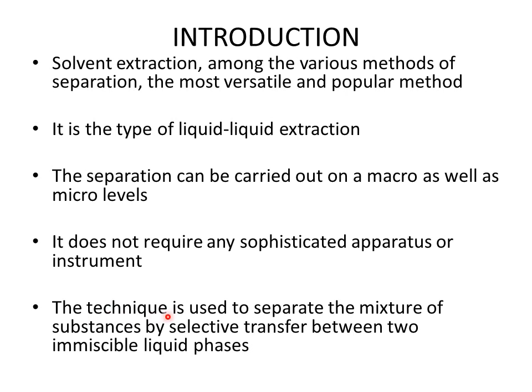The technique is used to separate the mixture of substances by selective transfer between two immiscible liquid phases. So as I mentioned earlier, it's a liquid extraction. The compound is made to transfer from one liquid to another liquid, and both of these liquids are immiscible into each other.